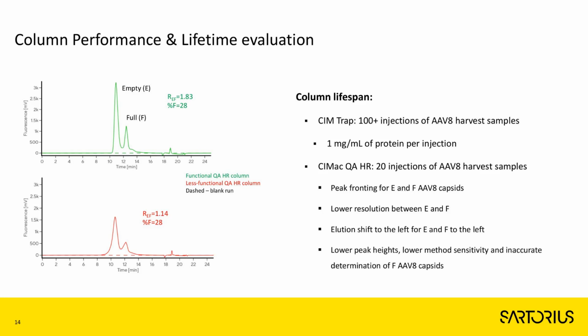So to actually hear how this tool can be used to do meaningful things and increase the titers and full percentages of AAV capsids, I'm handing over to my colleague Ivana.